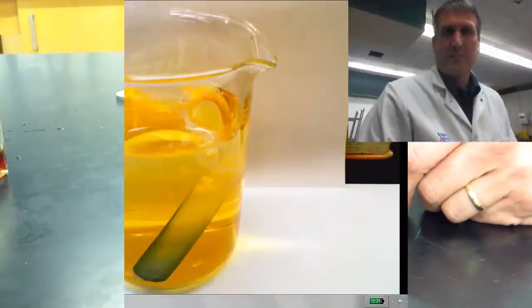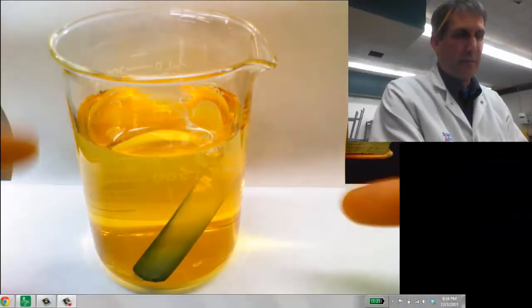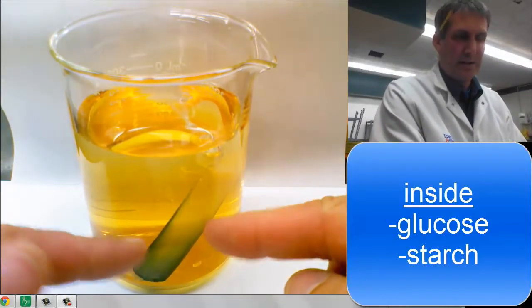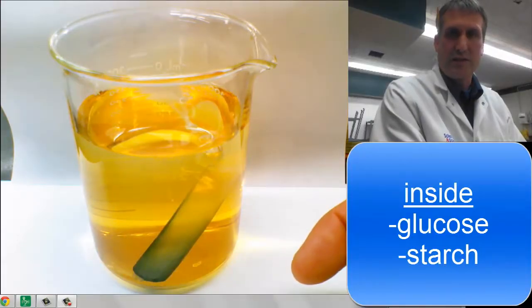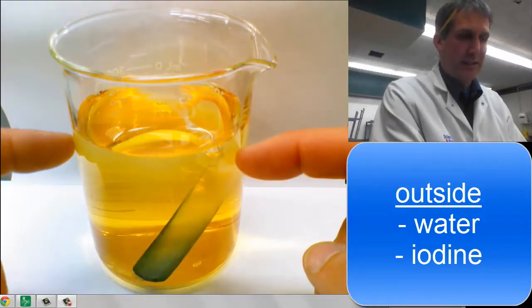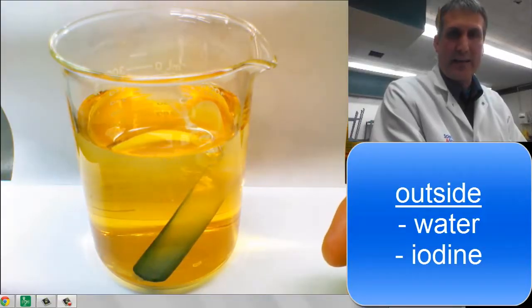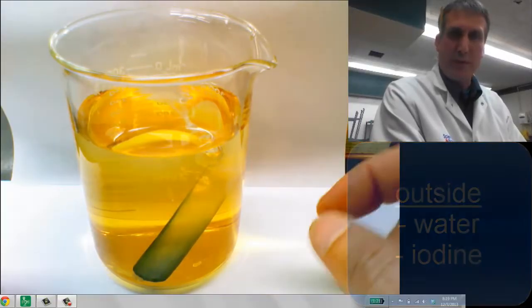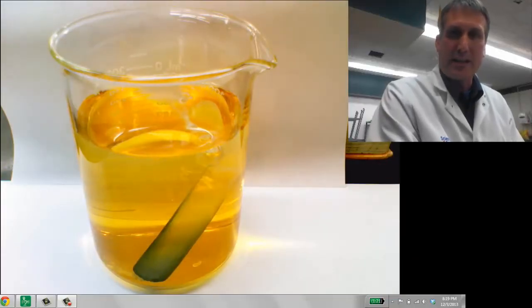Now we're going to let this sit. So here's our complete setup. The 400 milliliter beaker, your cell with glucose solution and starch inside, water filling up and covering the cell with iodine in the water on the outside. Now you want to put this aside, let this sit, and then we're going to come back to it and see if we can tell which molecules diffused in what direction.